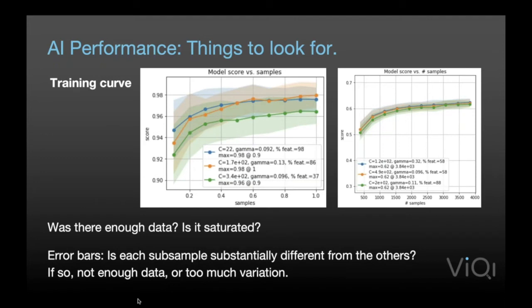And on the bottom, we're looking at the fraction of the samples that we used to get that level of performance. You can see as you increase the samples, you get better performance. And then you have a plateau, or at least a region of seriously diminishing returns, and it plateaus out at a fairly high level. So with 60 or so % of the samples, we are essentially topped out at just short of 98% accuracy. So that's really good.